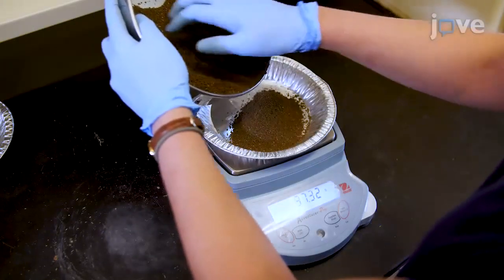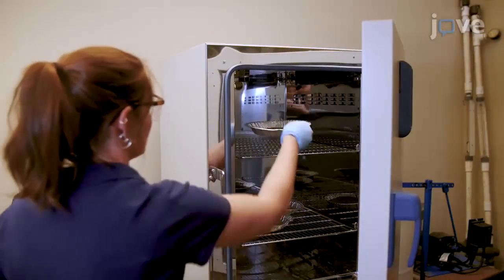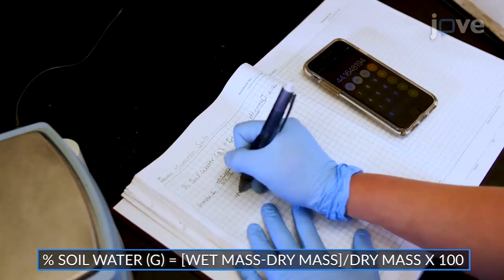Weigh out 100 grams of the field-moist soil. Dry in an oven at 105 degrees Celsius for 24 hours. Weigh the dry soil and calculate percent gravimetric water content.